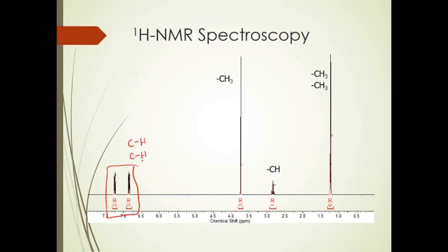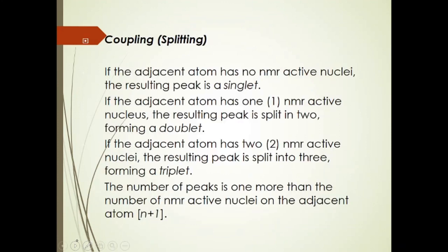In particular, again, the peaks are from the hydrogen, since this is proton NMR. But we have 2 hydrogens for this peak, and then 2 separate CHs for the other peak as well, telling us that in the aromatic region we have a benzene ring with 4 hydrogens total, meaning it's a disubstituted benzene ring.